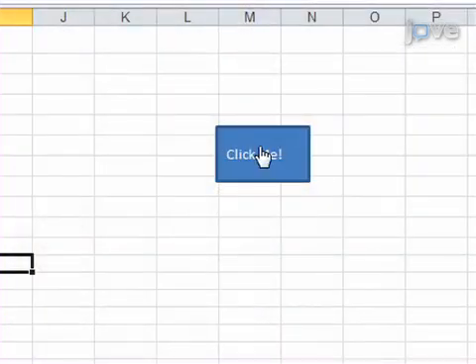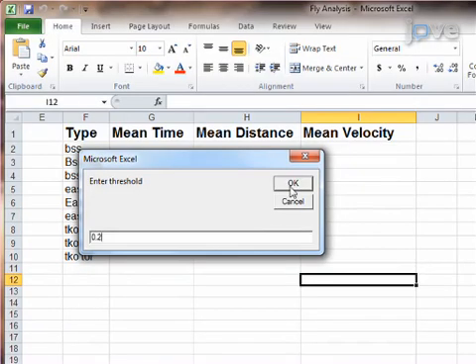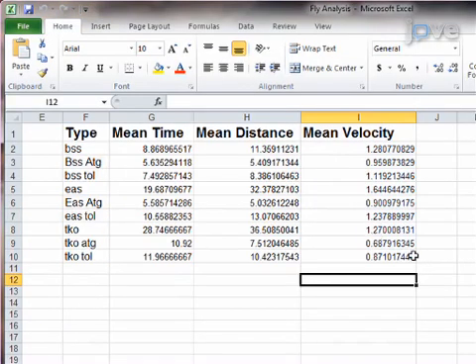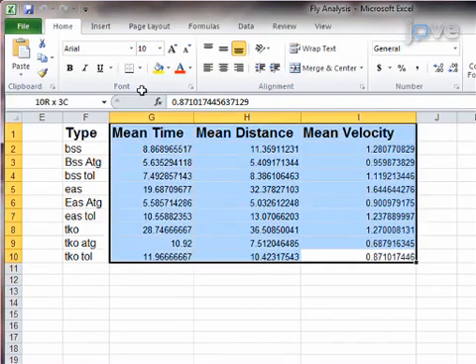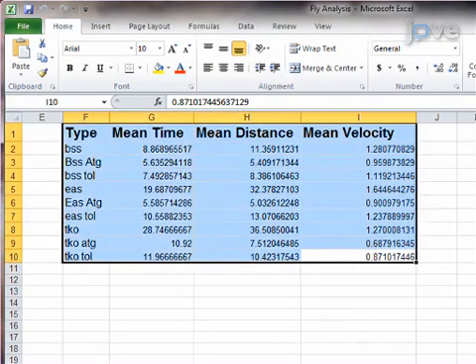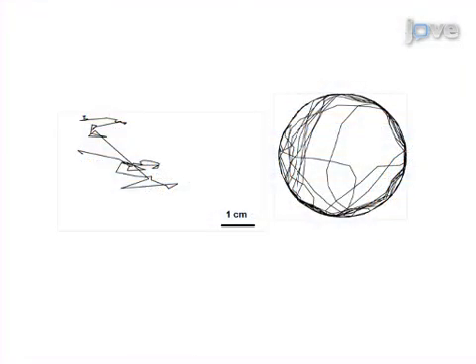Finally, custom-made fly analysis software is used to determine the distance, velocity, and duration of movement during the recording period. Ultimately, this assay can show changes in locomotor or seizure behavior that are associated with genetic and pharmacological manipulations.